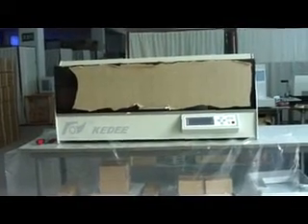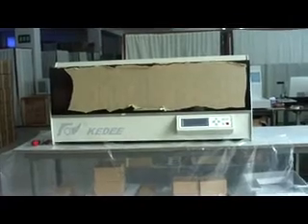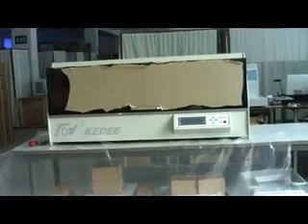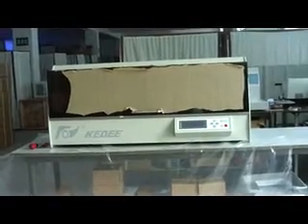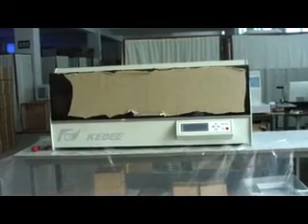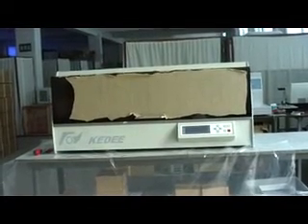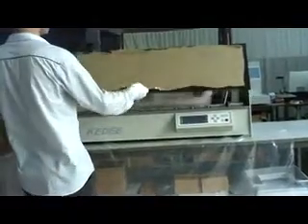The installation of tissue processor KD-TS3D. First, open package carton. Take out operation manual and accessories. Take out instrument and install the exhaust pipe bracket.